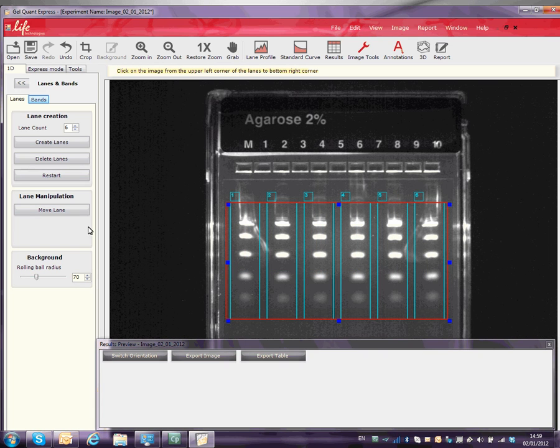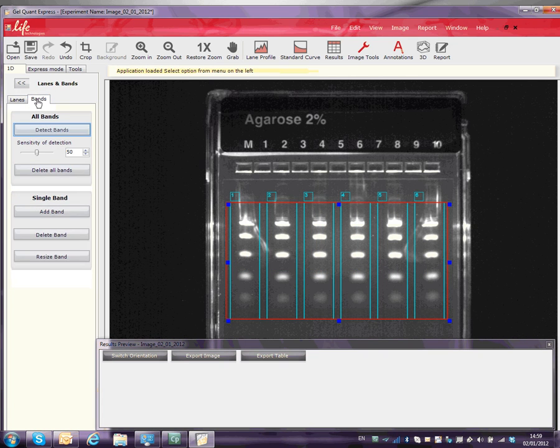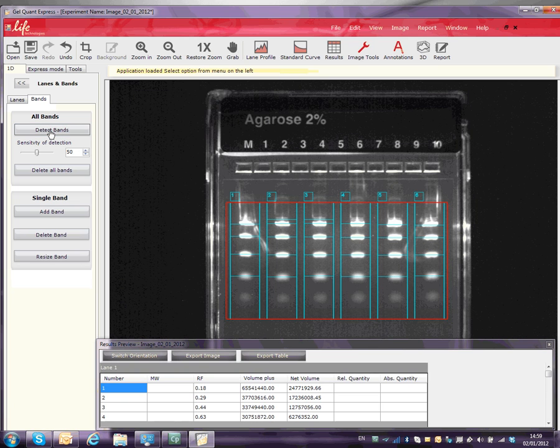Click on the Bands tab and select Detect Bands. The software will detect most bands, but some low-intensity bands may not be detected.